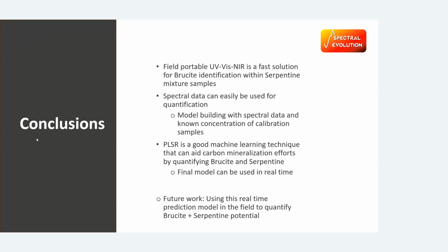So if you are someone who is interested in creating these quantitative models, model building with the spectral data, you can just use the concentration of those calibration samples to create that. You just have to keep in mind that you do have model maintenance. That very initial model that we create is not going to be the model that we use at the very end. So you have to constantly be doing maintenance on these things.